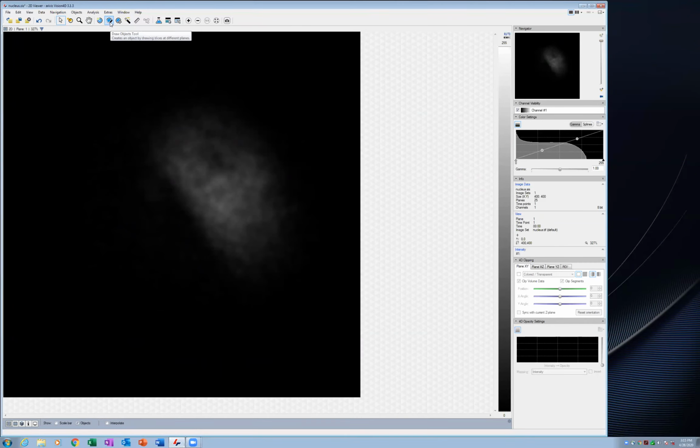Now what I'm going to do is go to, let's say, the middle of our object. You can see there's still a dotted line of that original one that I drew on the bottom. What I'm going to do is draw another one on this Z slice. I'm not doing this absolutely perfectly, but whoops. Good chance to show you the eraser tool.